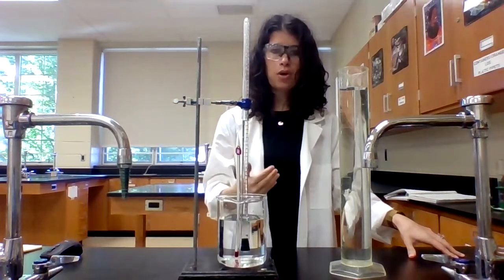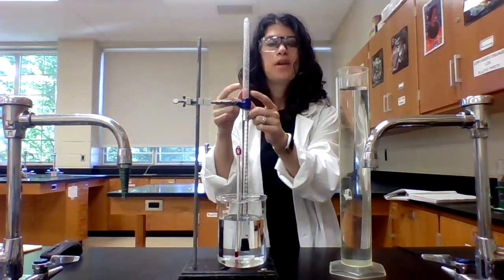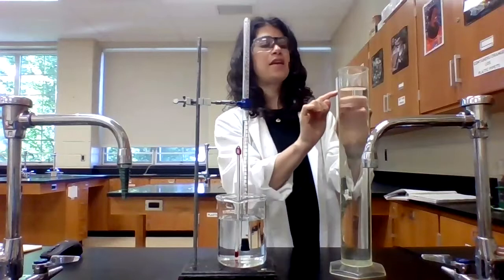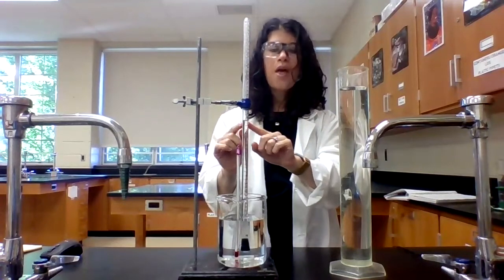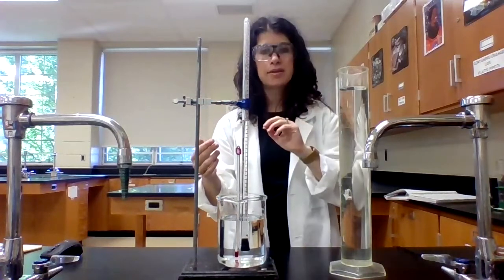So I need to know that the pressure of the room is the same as the pressure inside the eudiometer. Now, how am I going to know that they're the same? Well, the atmospheric pressure that's pushing down is affecting the level of water in the graduated cylinder. So if this level of water is at the same height as the level of water inside the eudiometer, then I know that their pressures are the same, and then I can record the volume of the hydrogen gas.